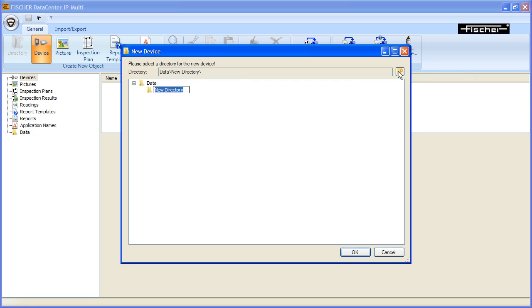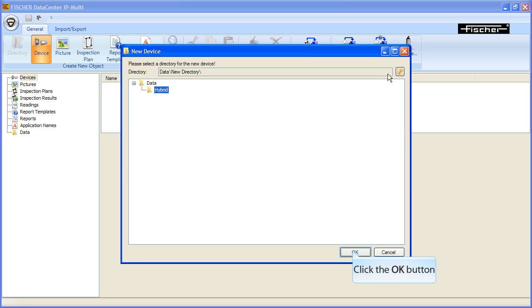Give the folder a new name according to your measuring application. Confirm the selection with OK.